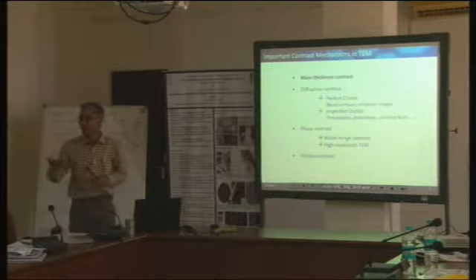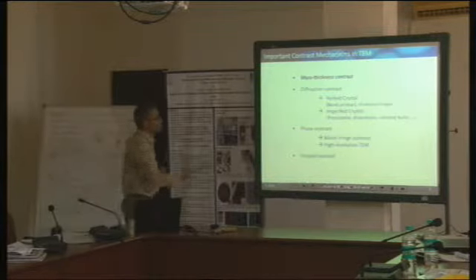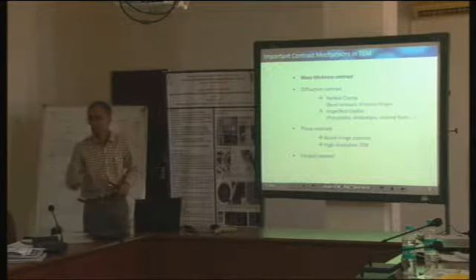So we see some contrast in the image and how to understand that. So that should be our aim. And these are the prominent mechanisms by which contrast comes up in the sample.